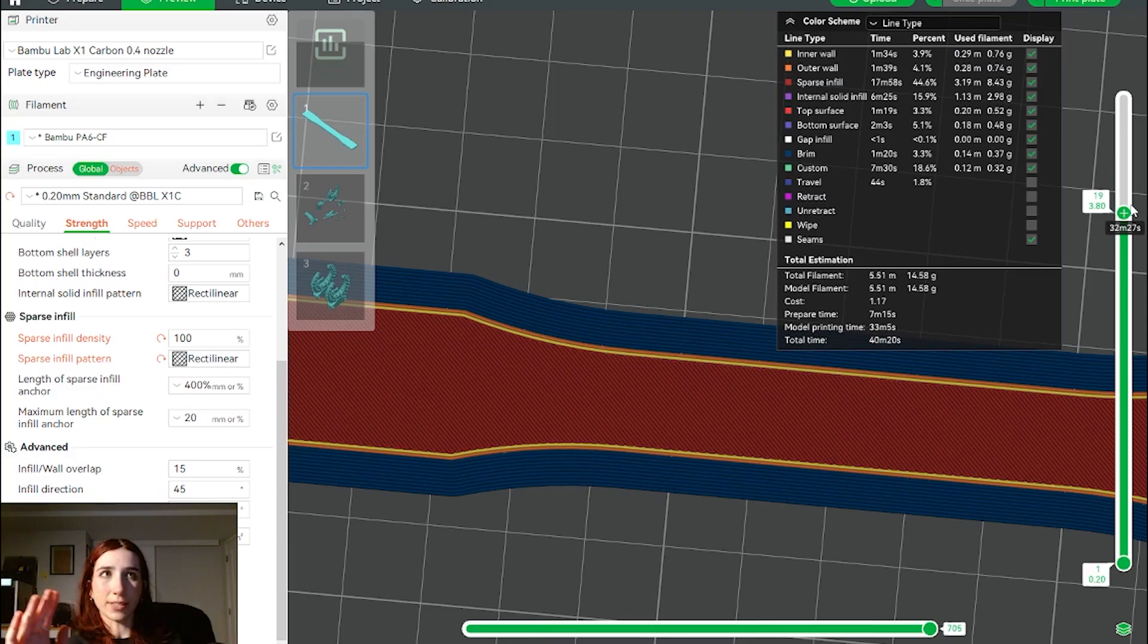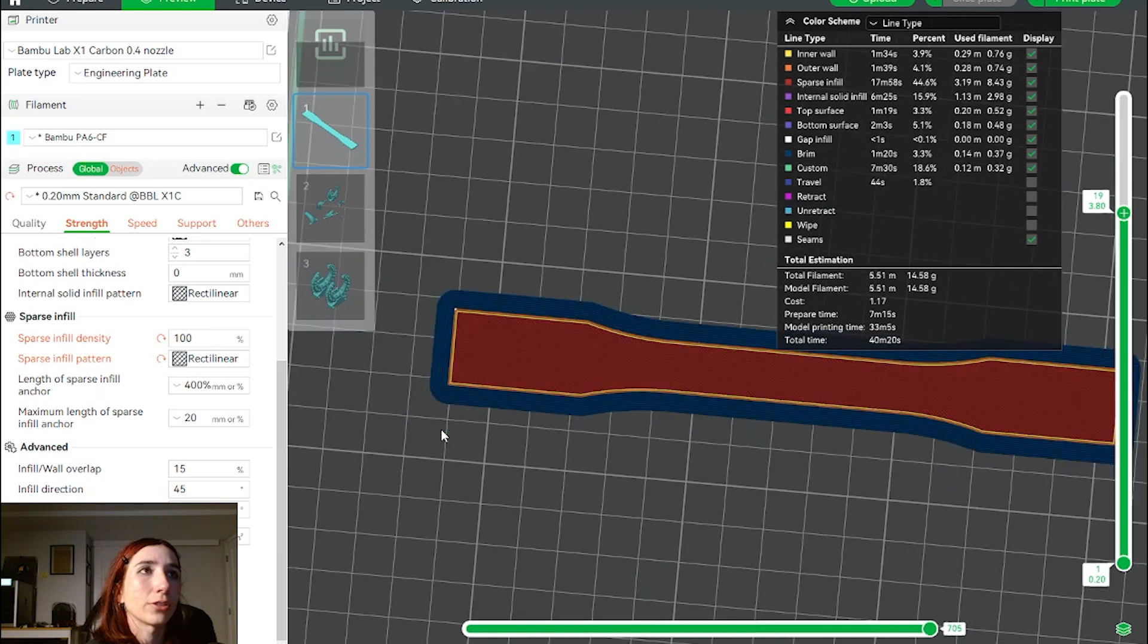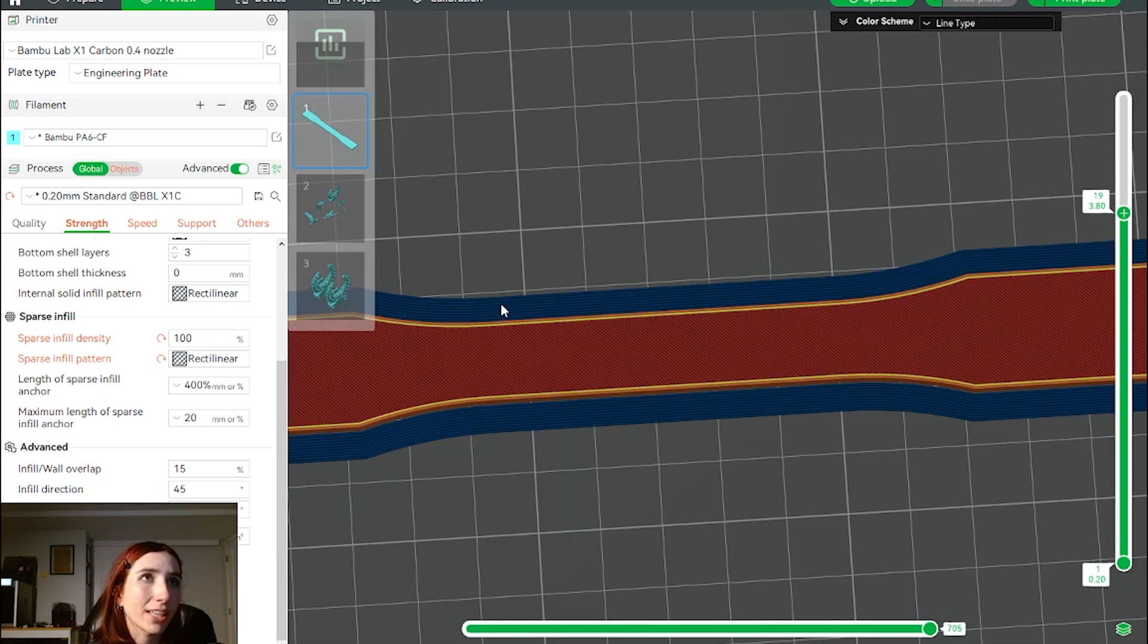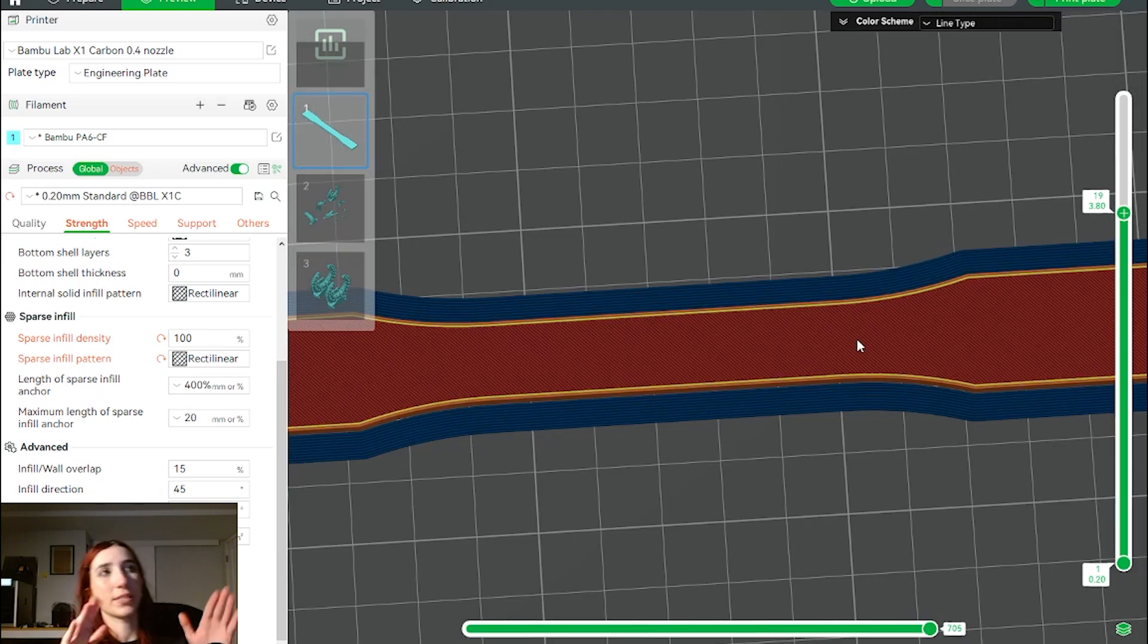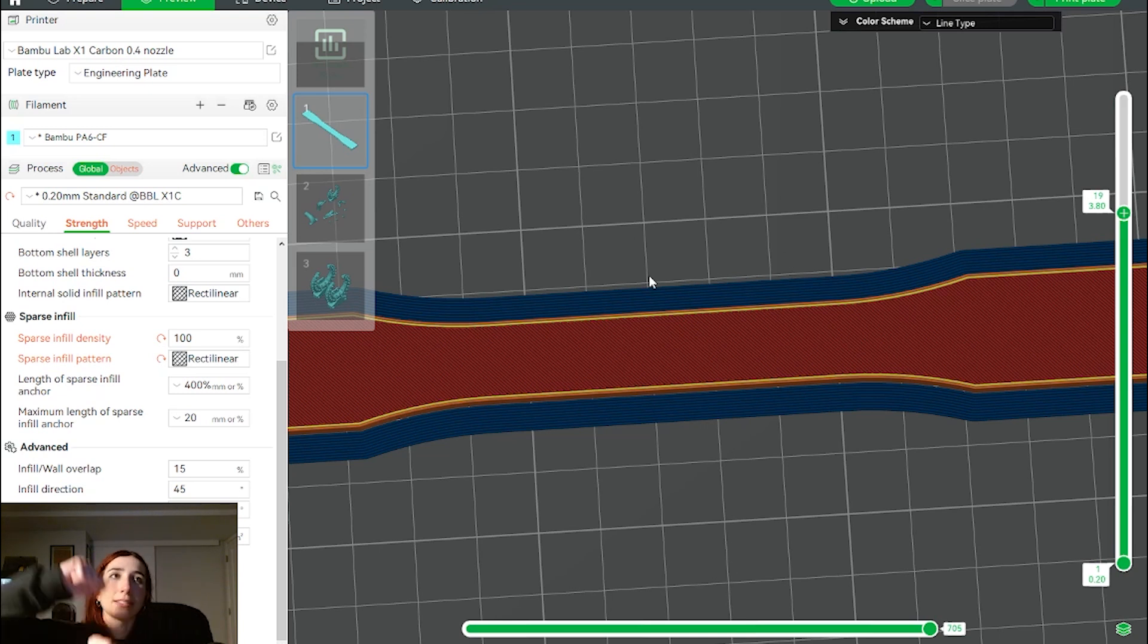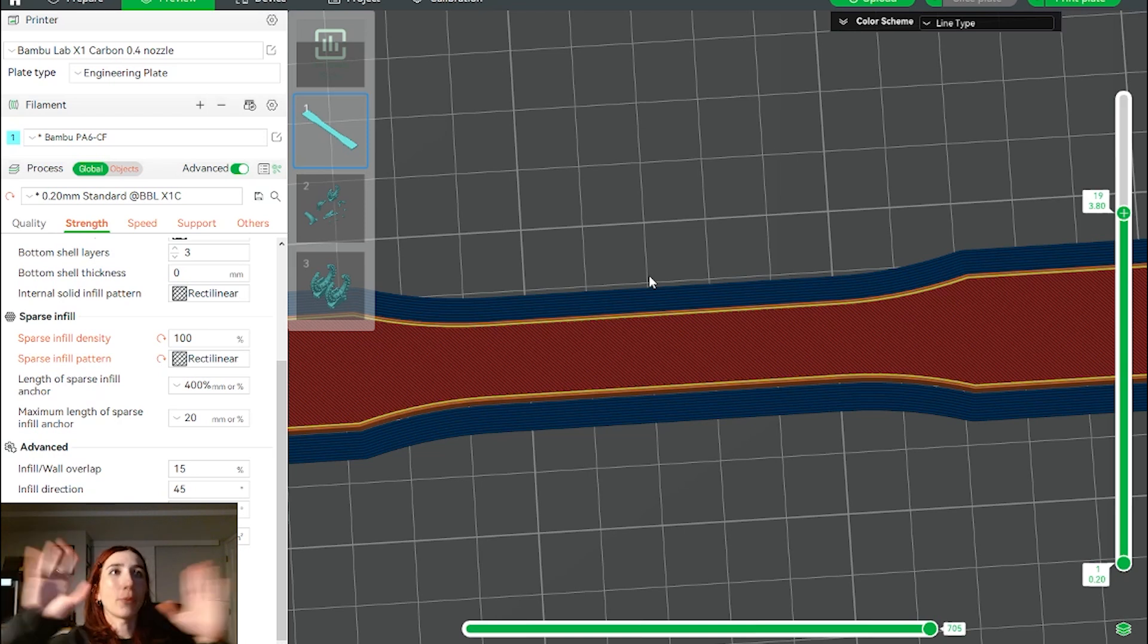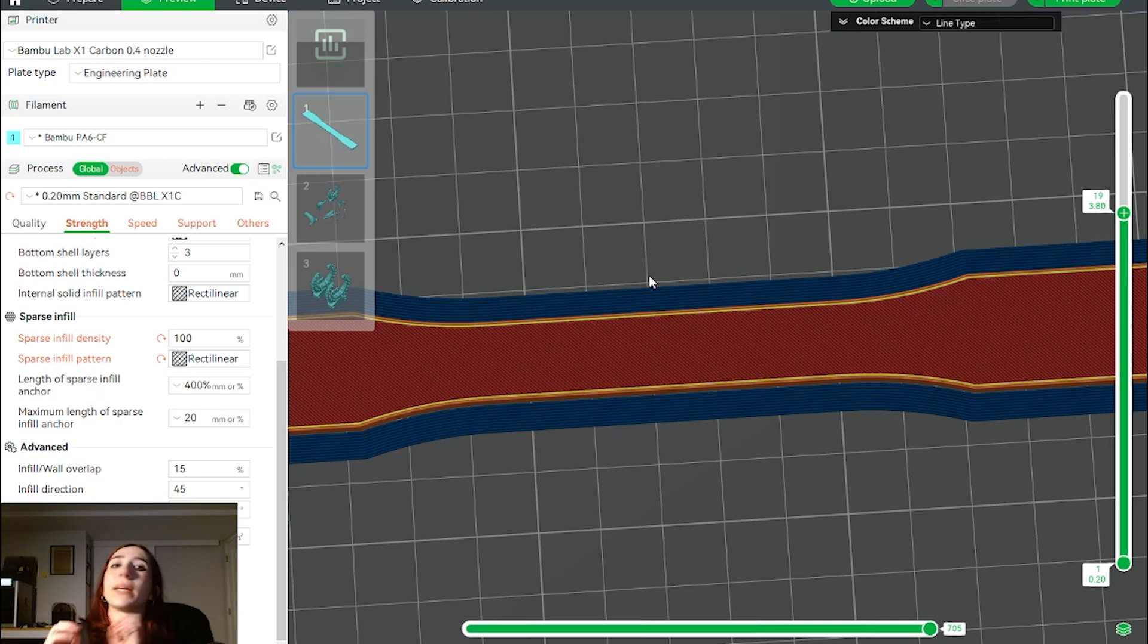From the previous samples they kind of cracked all outside of the gauge length. The gauge length is this center straight piece which for this sample it's 50 millimeters and this is where we're looking for elongation of the part as it's being stretched. Any break within that 50 millimeters is considered a successful test and we can use that data to characterize the sample.